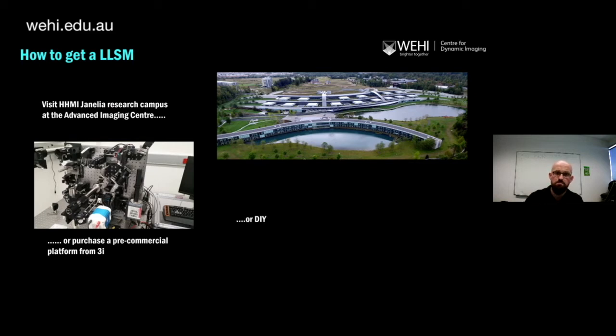The other option is you could build it yourself. Now, this was made quite easy because Betzig and his team recognized that there's going to be this gap. They're going to invent a tool, and then they're going to license it to Zeiss, and Zeiss will spend anywhere from 5 to 10 years turning it into a turnkey solution. But in that time, you need it to be in the hands of those that are going to do the most with it, the biologists.